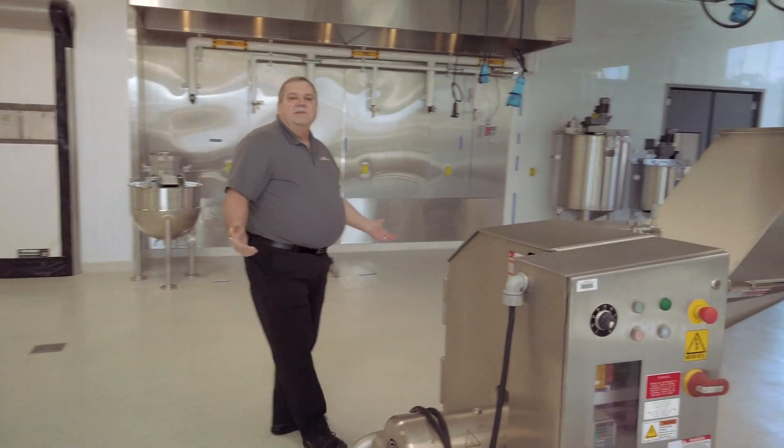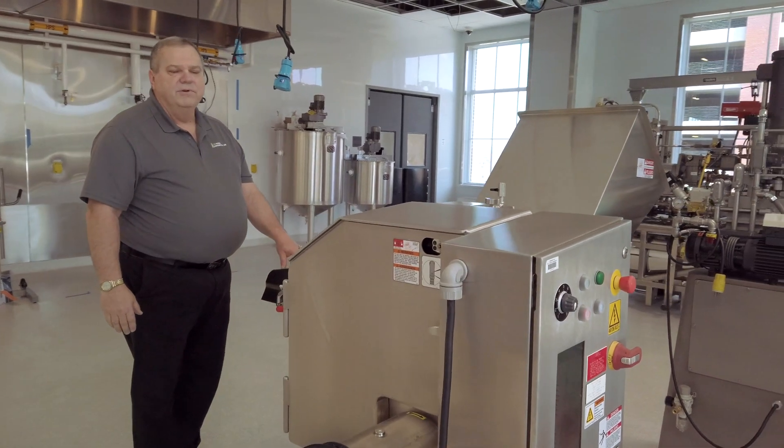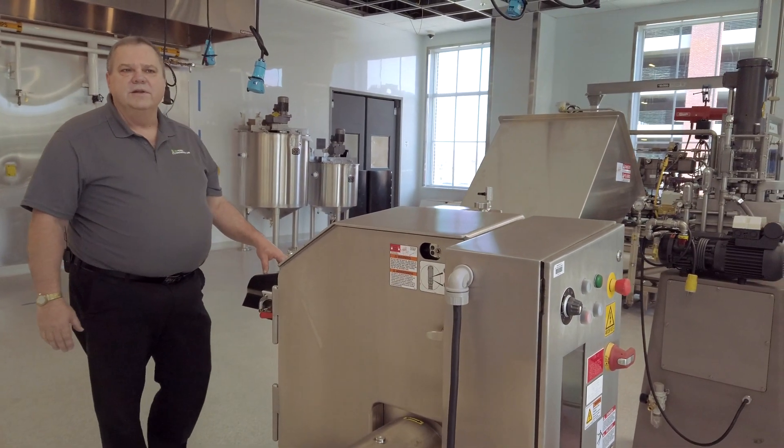We can also make chopped vegetables using the Urschel Sprint tube machine. This machine will slice, dice, crinkle cut, and perform a number of other different cutting configurations.